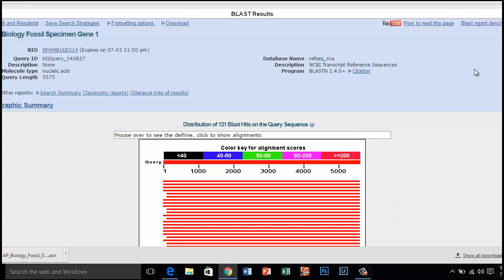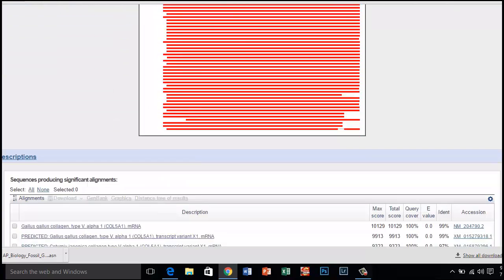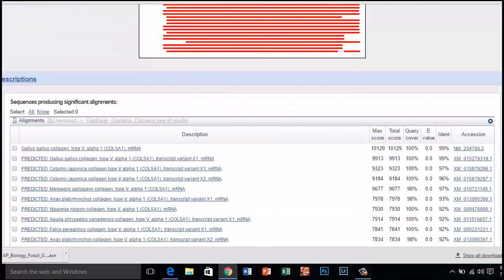Scroll down to the section titled Sequences Producing Significant Alignments. The species in the list that appears below are those with sequences identical or most similar to the gene of interest. The most similar sequences are listed first.